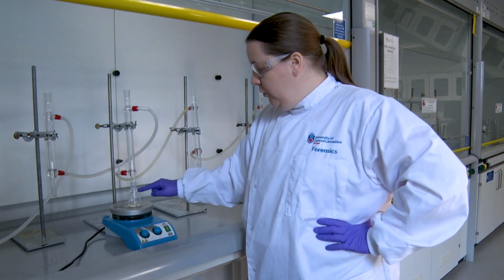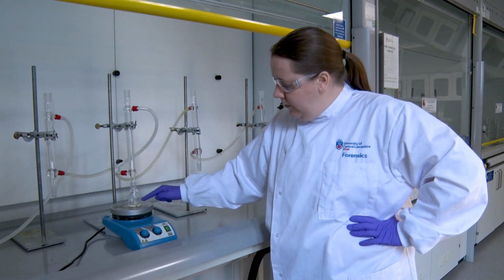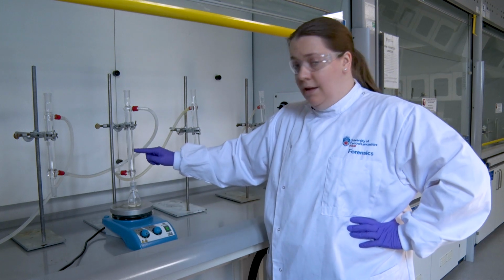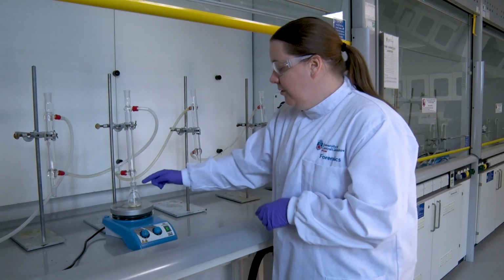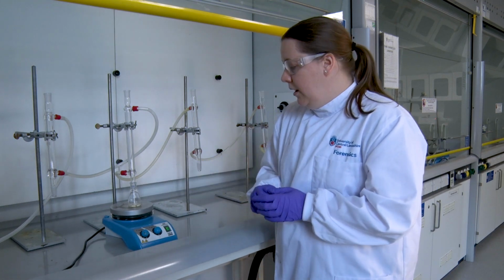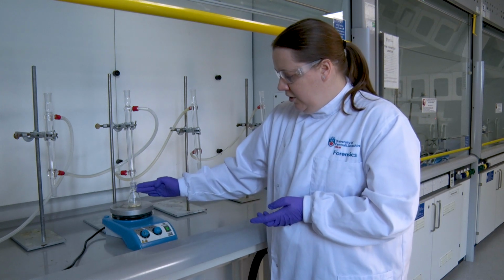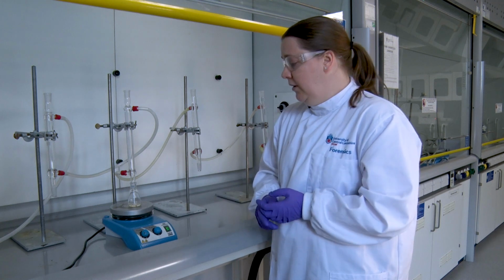What we're looking out for to tell that it is at reflux is when you've got the reaction mixture boiling, going up into the condenser, vaporising and then dripping down the bottom of the condenser. Now the reaction's at reflux point. We recognise this for two reasons. You can see down the edge of the flask, I'm not going to touch it because this is quite hot, this solution is going down and it's also dripping down the bottom of the condenser. So now you can start your timer to time the 20 minutes it needs to reflux for.